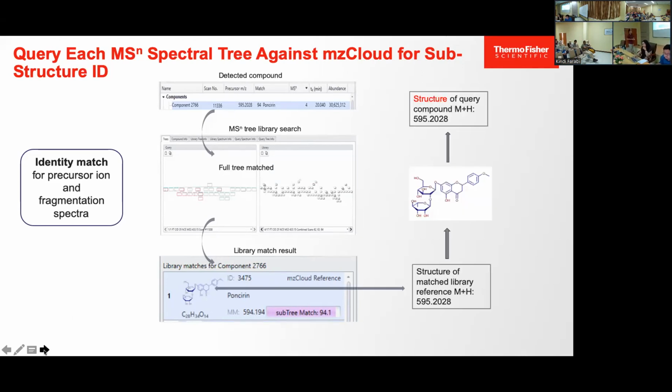Next. So if the structure is actually matching, then you know that this is correct. Then you can always, based on the chromatography, check the polarity. And you may have an internal standard. So the internal standard retention time will always be able to confirm this. Next.